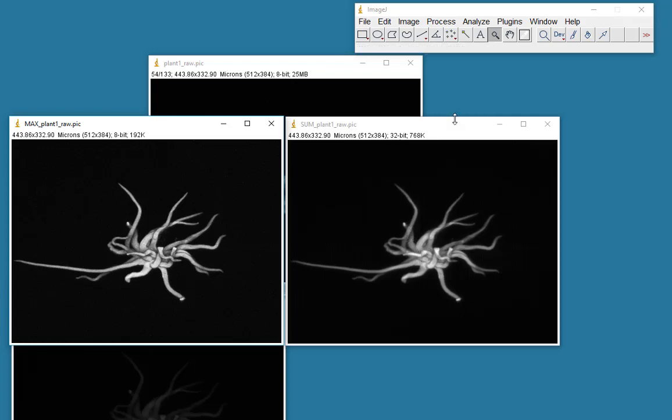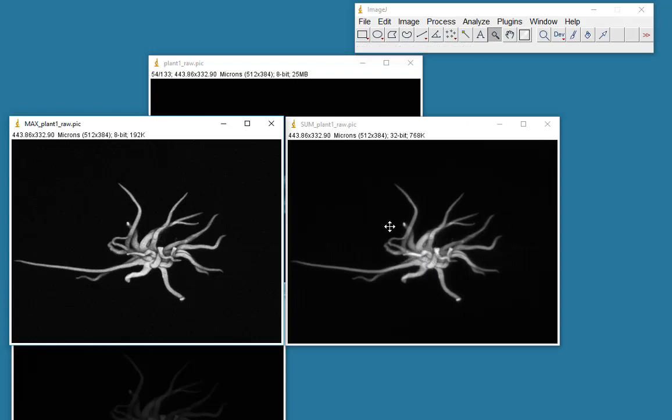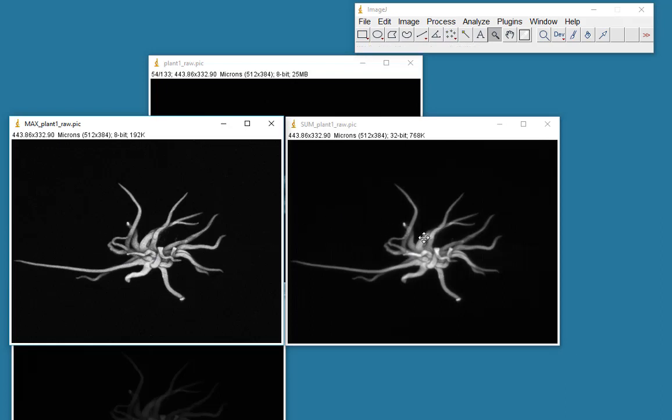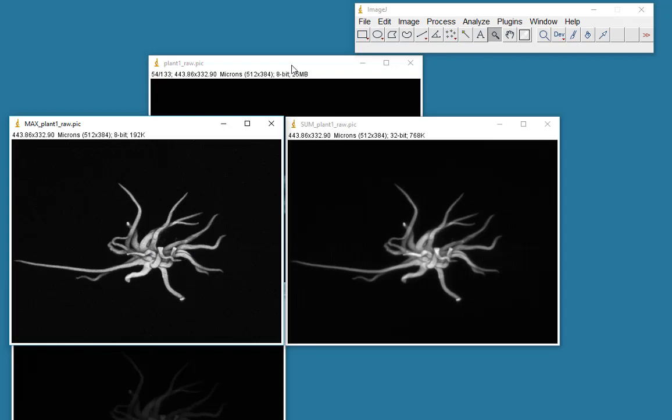And if you look at the numbers up here, as I run the mouse around, you'll see that we get much larger values. And it's for you to decide whether you think that this image here is a nicer quality than that image there. And your choice of whether to use a maximum intensity or a summed intensity would be dependent on your particular application.